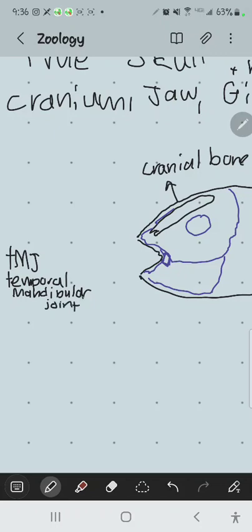And that is a piece of cartilage that cushions the jaw as it articulates off of the upper skull. And so the shark mandible now is reduced down to just a little cartilage pad. Some people have TMJ issues, and my suspicion, or just kind of my thoughts on this are, it's ancient cartilage. This is cartilage that goes all the way back to a shark ancestor.